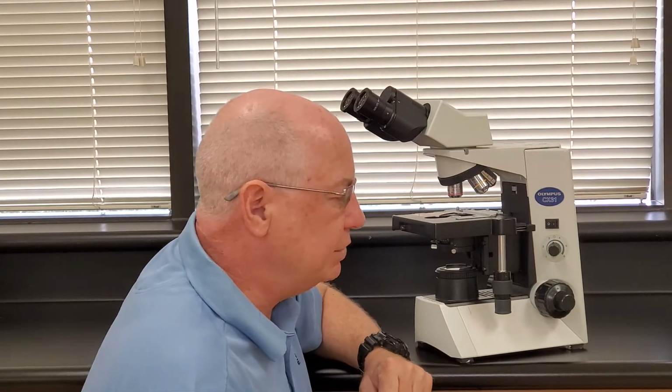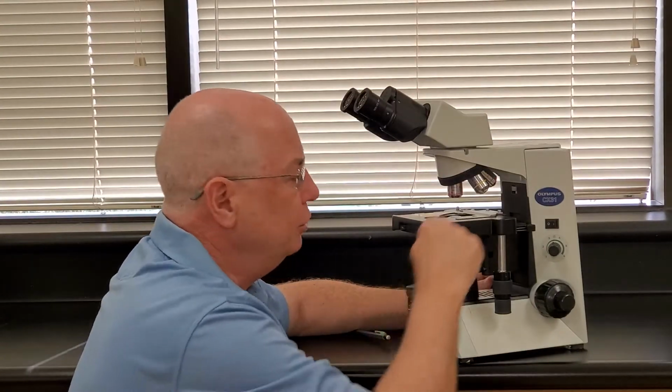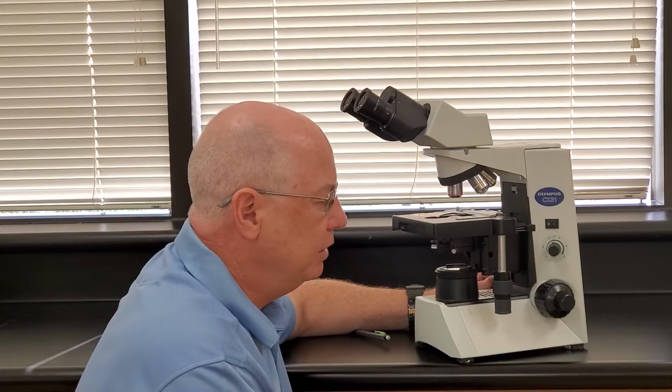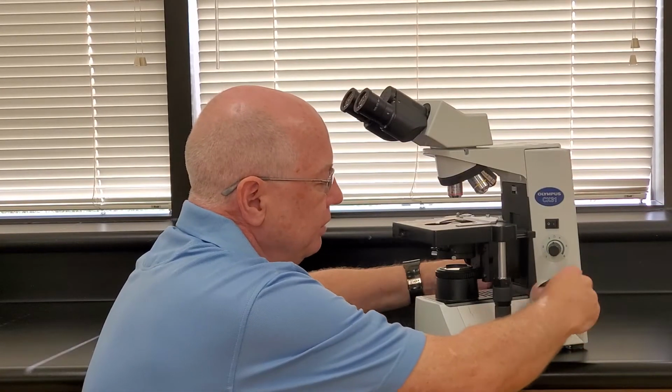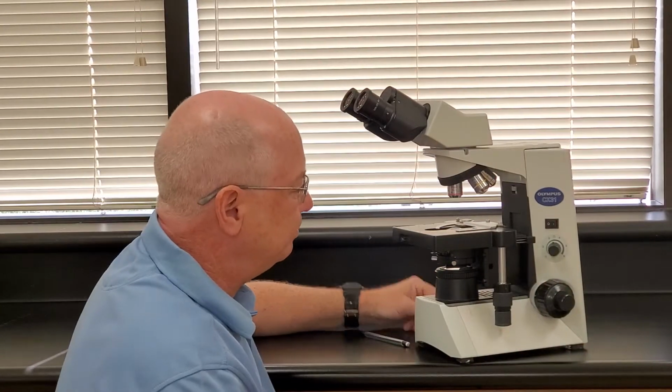And one of the mistakes that students make is they use the fine focus knob first. Don't. You start with the coarse focusing knob, or the bigger of the two knobs. I always remember big, red. You start with the big knob and the red objective always. You end with the big knob and the red objective. Coarse focusing, low magnification. So when you get a slide out, your stage should be all the way down, and you can check that with the coarse focusing knob.